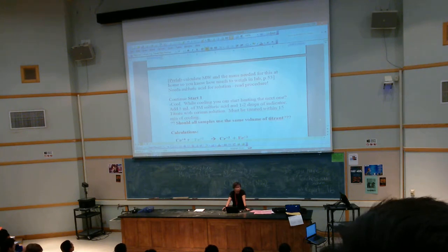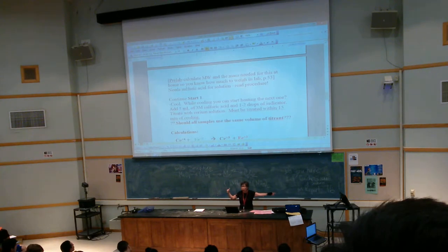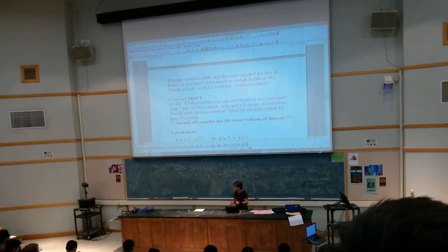Just like your unknown 16, you had the same volume of sample, right? You should have pretty close volume of titrant. Your titrant volume may not be the same as the other person's because the cerium salt you weigh may be a little bit different. So don't expect to have the same volume. And you have different unknowns, so you may not have the same volume as the person next to you, but your four trials should be very similar, all right?